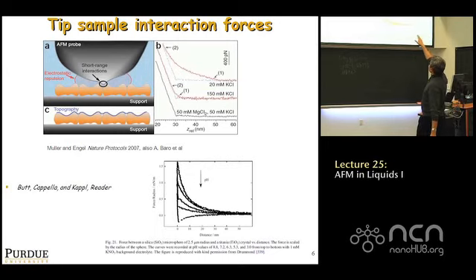The cantilever starts bending up, and you can argue that you finally might touch the sample at a Z value of about 25 nanometers, when you see that the red curve roughly joins what you would get if you had no interactions and just a direct contact with the surface in a 45-degree curve, as expected on a hard surface, right? So what that would suggest is when you are using the 20 millimolar potassium chloride, the length over which the interaction forces begin is roughly 25 nanometers. It's from 50 to 25, so the Z distance, or the gap at which interaction forces begin, is roughly 25 nanometers from the surface, right?